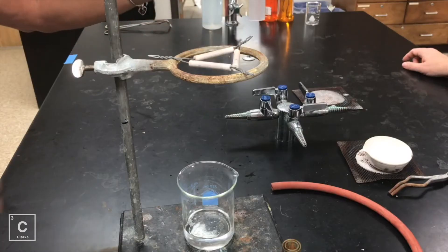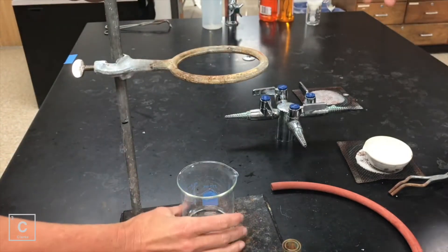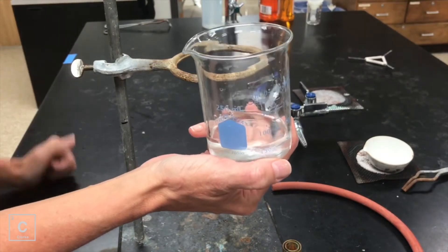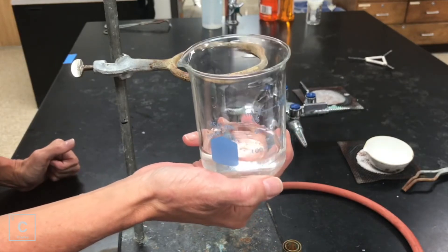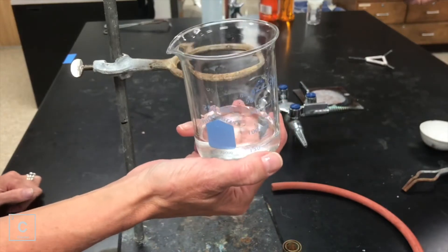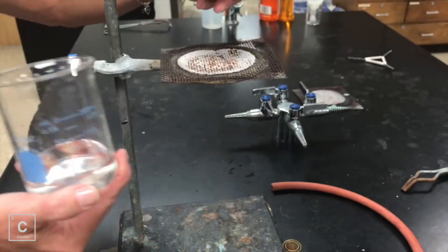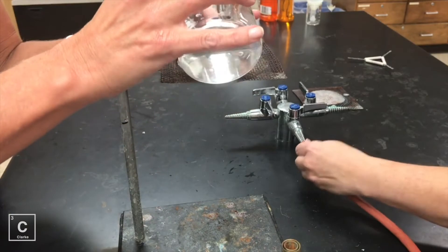We're going to remove the funnel and the clay triangle. Now we're going to look at the contents of this beaker. This is the runoff from the filtering and we call this the filtrate — the filtrate is what's left over. So now we're going to put our wire gauze onto our ring clamp and we're going to put our evaporating dish. I am going to pour my filtrate into my evaporating dish.